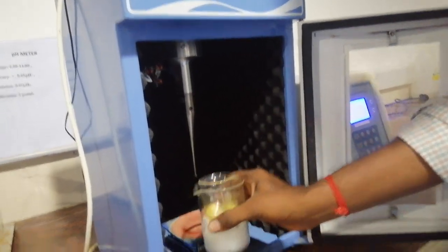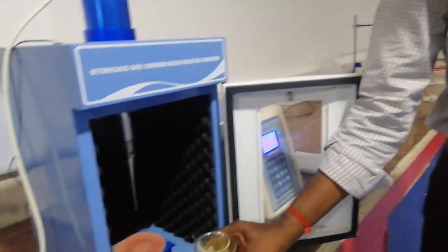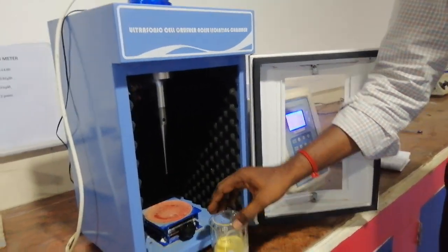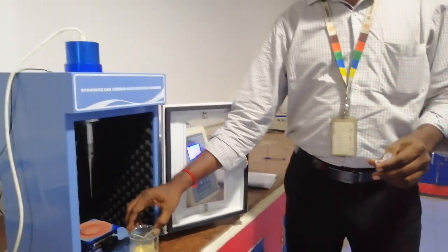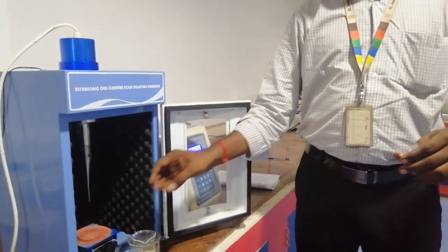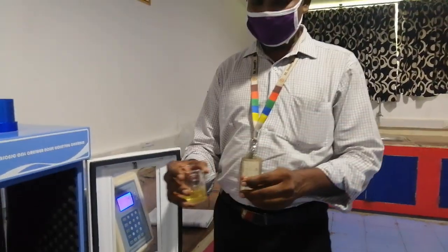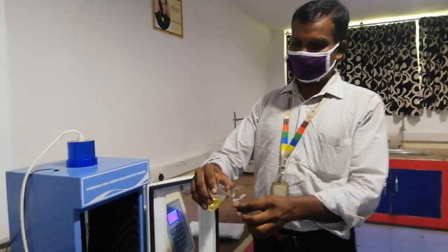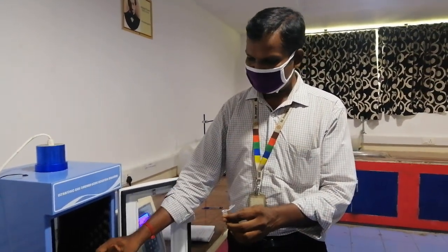Take out your sample carefully, and then collect it using a micropipette. So you have to use a micropipette to take your sample. Collect 0.5 ml to 1 ml of your disrupted cells.